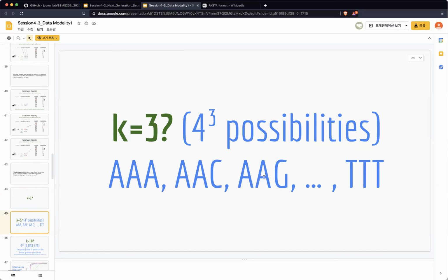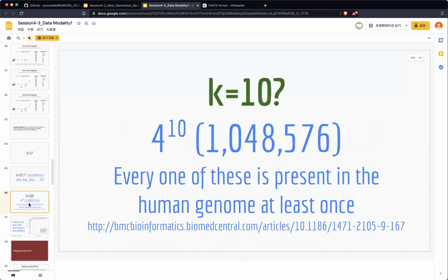So all of DNA sequence information has to fall into these combinations, right? But if you can use much longer k-mers, right? So you can use 10 characters, right? So that has much more possibilities, right? So it takes some computations too.